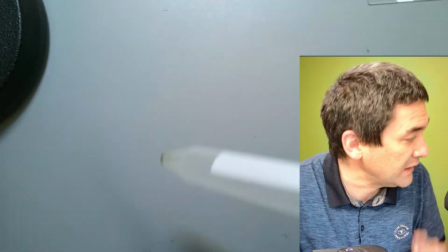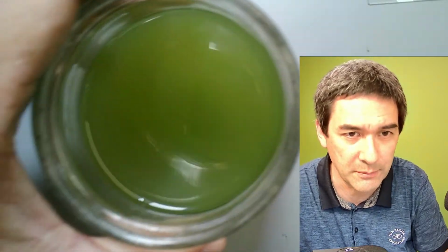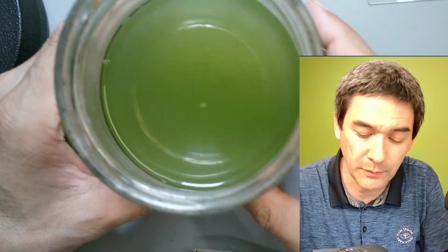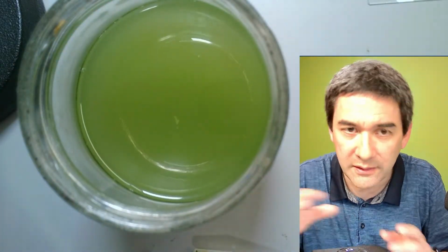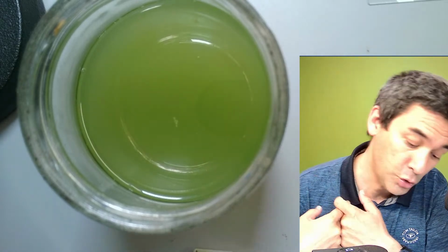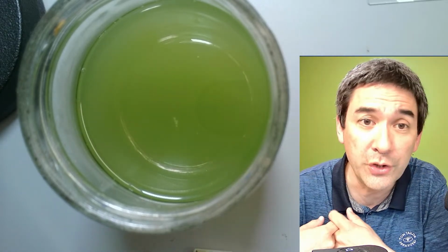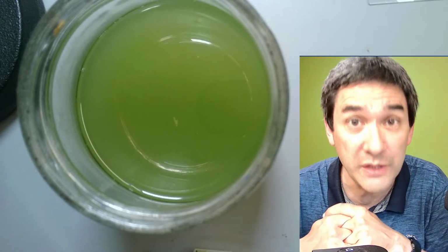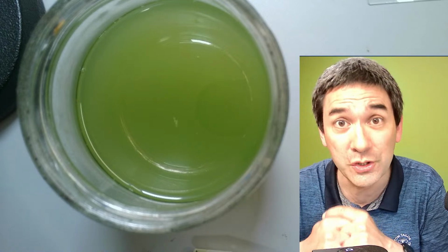So we talked about cameras. I put some old sand samples in here, and another sample that I did not try yet, but look what happened here. You know this one already from some time ago. Also last year or so, I collected rainwater in the forest. There was a small temporary puddle with water fleas. I collected a jar and the water looked brownish and muddy. This water here does not look brownish muddy anymore, it looks green. This basically means that algae started to grow in here.